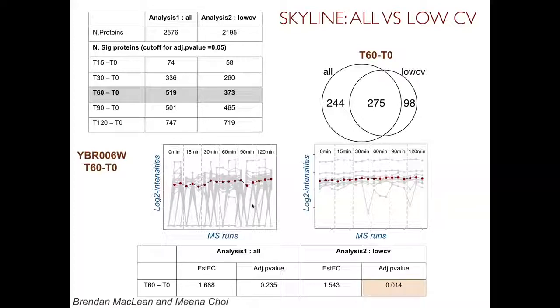Again, how did they do this? They actually had a prior experiment where they learned how much variability different features have, and they used this prior information to eliminate highly noisy precursors from the study. So they lost some proteins here, but I think overall the quality of the study improved quite a bit. And if you remember from Monday, when we talked about the fact that these very long protein lists have negative implications for statistical analysis, right? I think we can see the same thing here quite a bit.